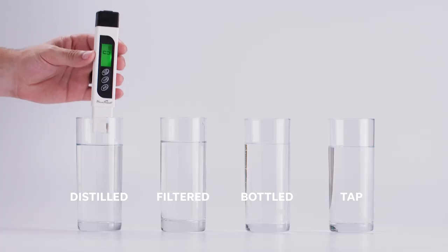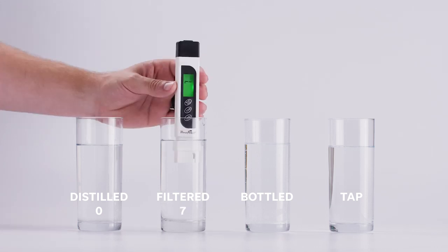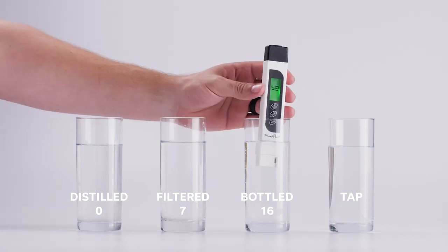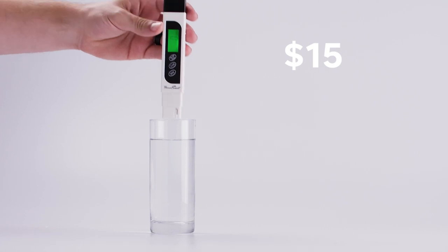We all love water, but what exactly is in it? It's hard to tell just by looking at it, so we want to test it, and there are some easy, cheap ways to do that. The first step is to get yourself a TDS meter. TDS stands for total dissolved solids, and that's going to tell you how much extra stuff is in the water. A TDS meter is great because it's a cheap way to get a baseline level of your water — only about $15 online, and you can use it over and over again.